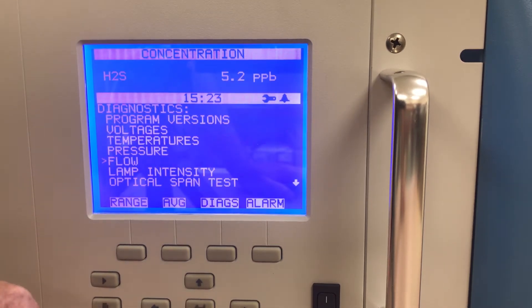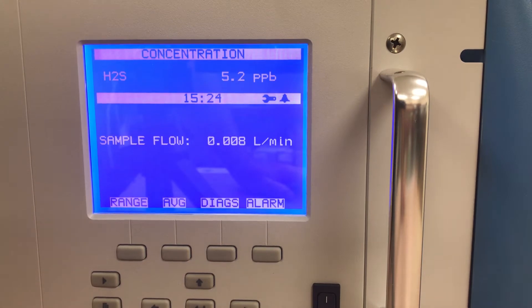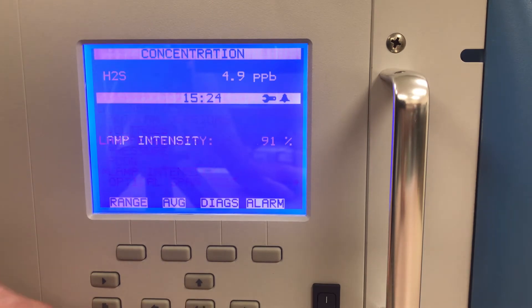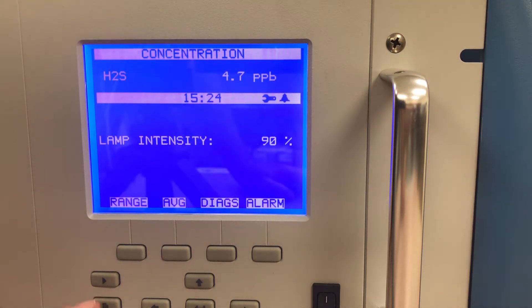I can go back and look at flow — sample flow. If the flow is dropping and getting closer and closer to zero, that's a pretty good indication that I should change the pump diaphragm, even though I don't have a maintenance log of when it was last done. Lamp intensity — if we're looking at a good lamp intensity of 91%, but it's dropping around 70% or 60%, then by looking at this menu I know it's a good idea to change that flash lamp, even though I don't know when it was last replaced.